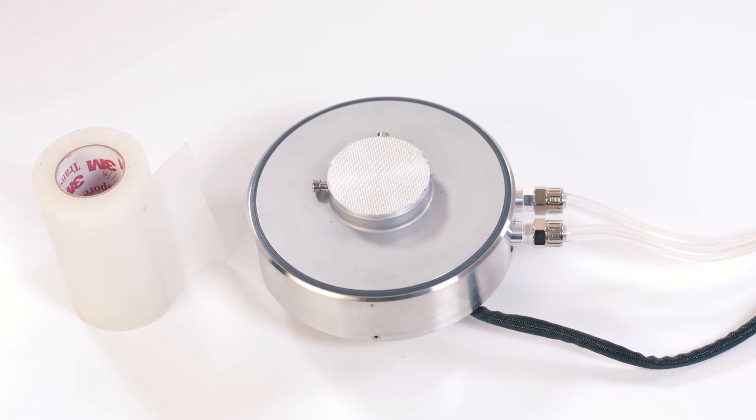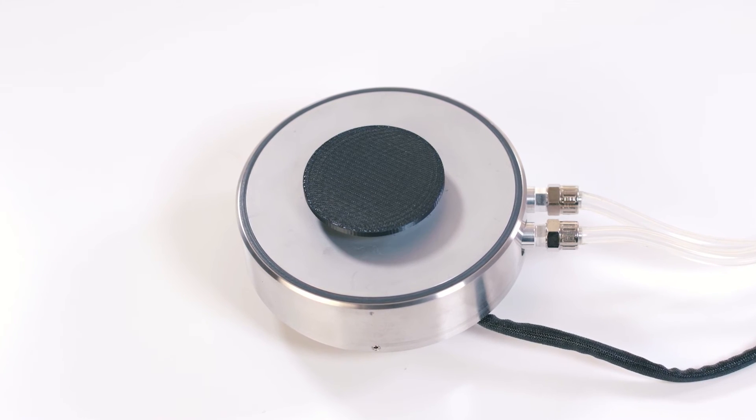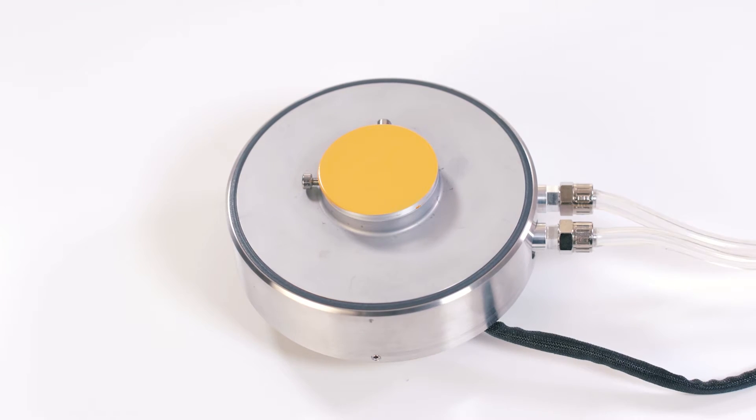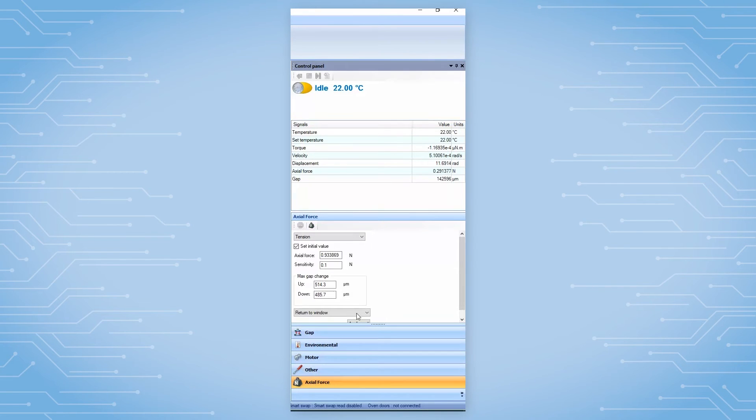Depending on the testing need, users can attach different types of substrate to the bottom plate or use different types of upper balls. Setting up a triboreometry test on a Discovery Hybrid Rheometer is very straightforward. First, after attaching the upper and lower geometry to the rheometer, users need to zero the gap. If needed, from the TRIOS software control panel, also zero the axial force.